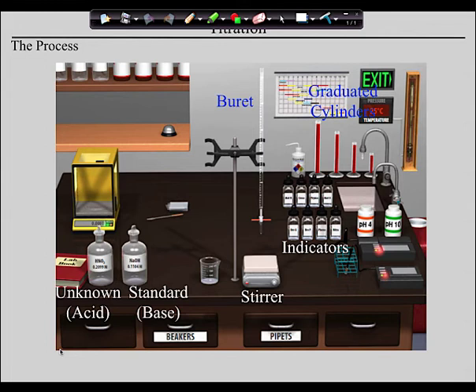So guys, this is what the software looks like. Let me turn on the light, grab your labs, and we are now going to do this lab together. You ready? We are going to go through the procedure. I am going to share with you all the tricks that make this lab work better. It will be to your advantage to write these things down next to the procedure steps so that you can be successful too. You ready?